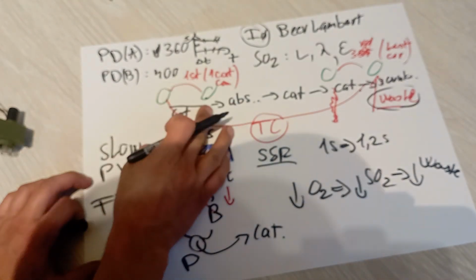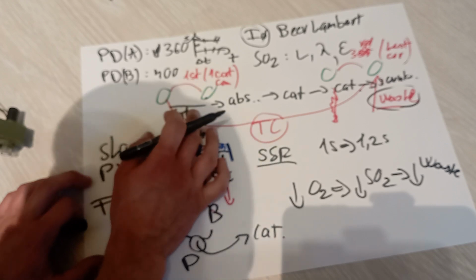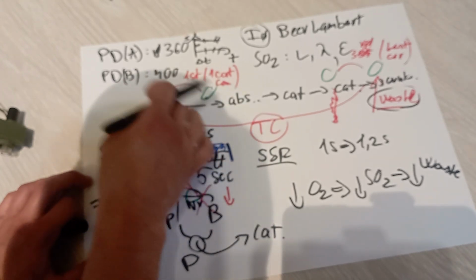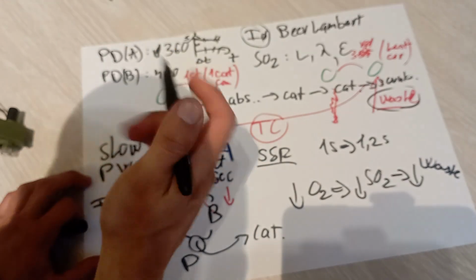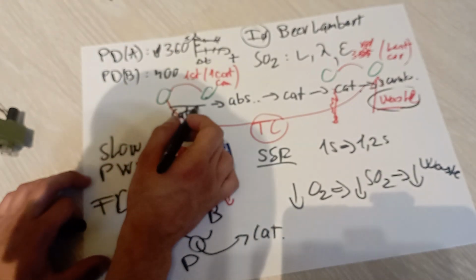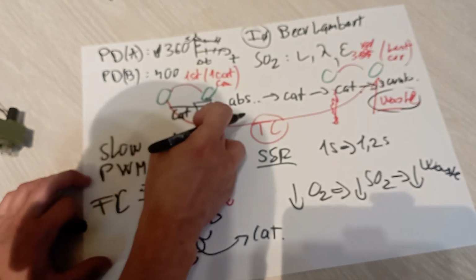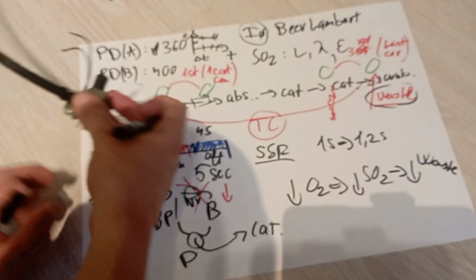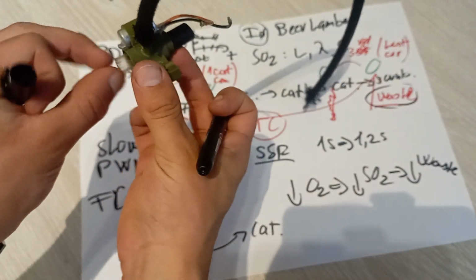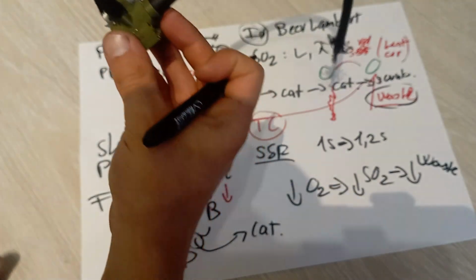Of course, the outgoing gas is not going to be totally 400 degrees, as it's not going to be able to transfer its total heat, but it certainly is going to heat the quartz wool or the quartz tubing here that is inside, and that has the possibility to heat up so much that it would melt the case and the whole thing would just collapse.